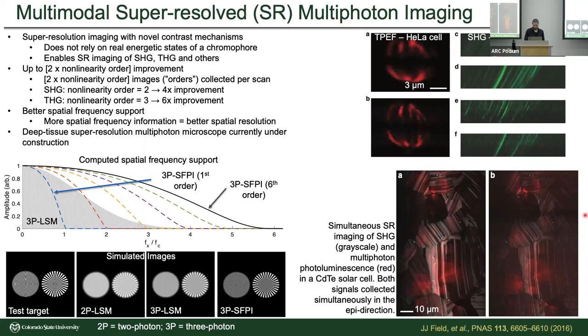All right, I see questions showing up in chat. Okay, so there's a question in the chat. Is it possible to generate a second harmonic signal in stretched network collagen, to distinguish well-organized fibrous collagen from poorly organized, misfolded collagen 1 due to genetic disease?